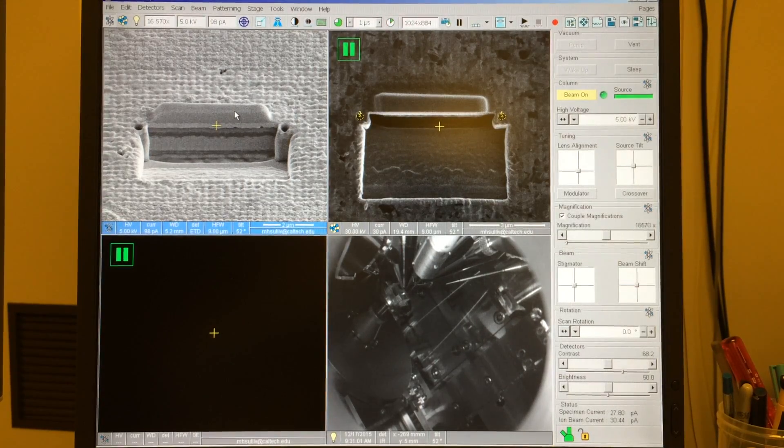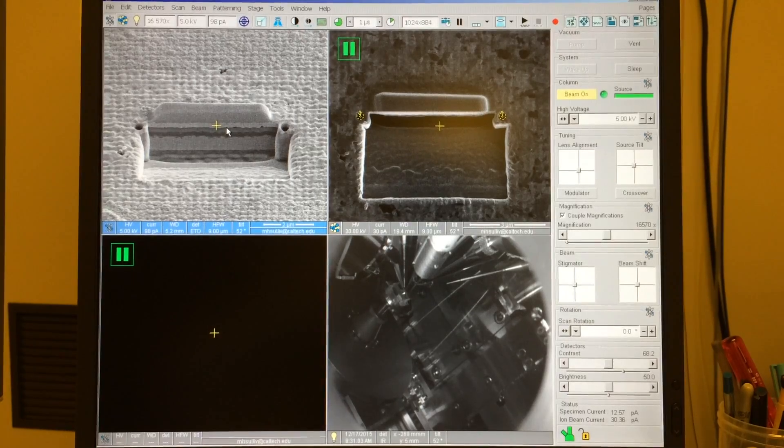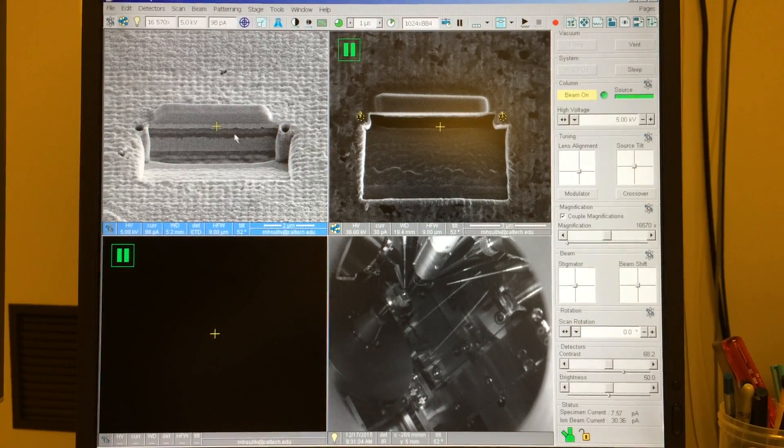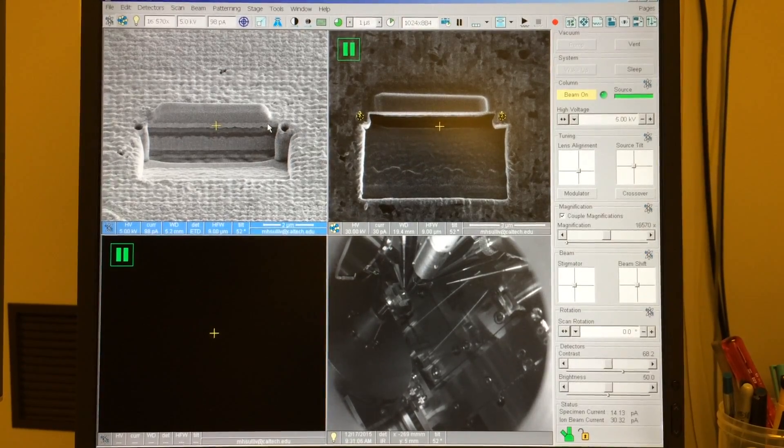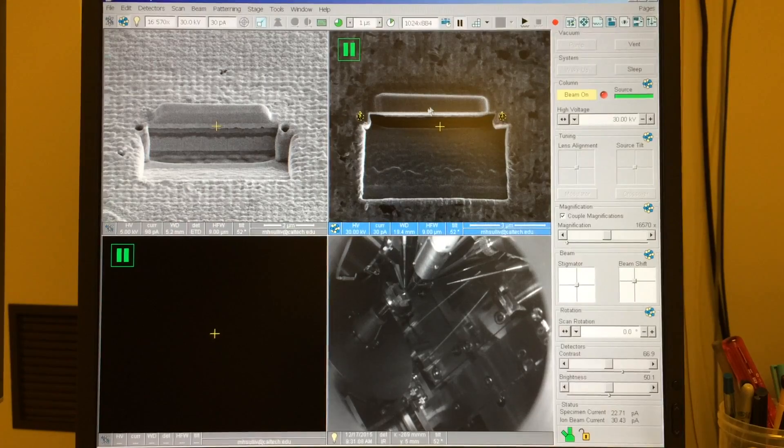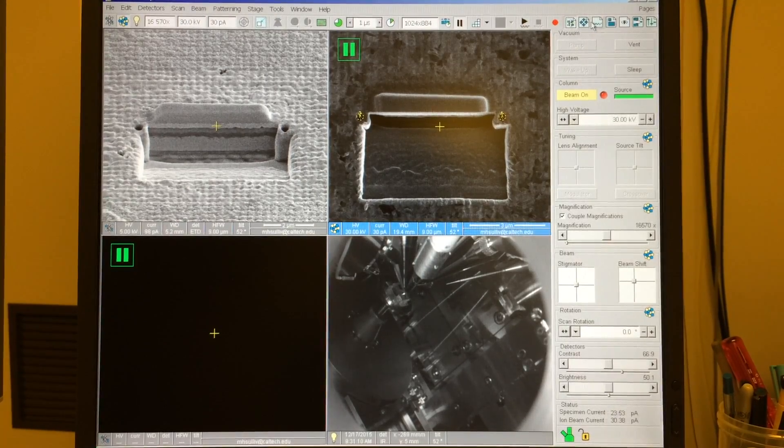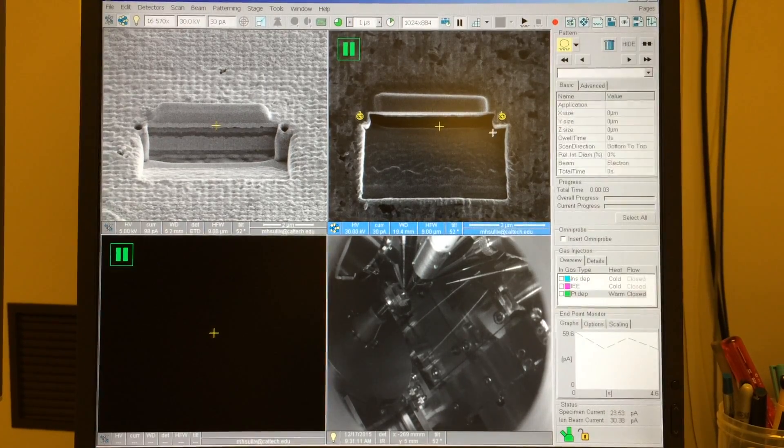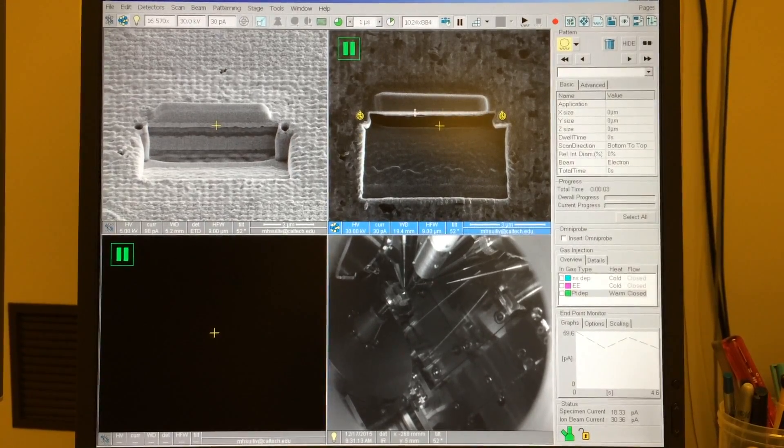Here I've just finished cutting a cleaning cross-section at 30 kV and 30 picoamps on this specimen. And the last thing that I did is, using the ion beam, I've milled two circles adjacent to the cross-section surface.